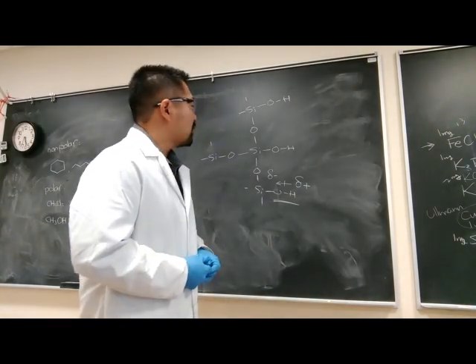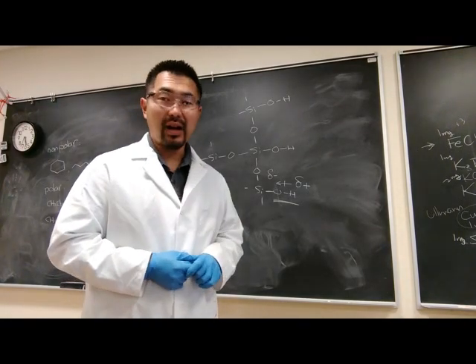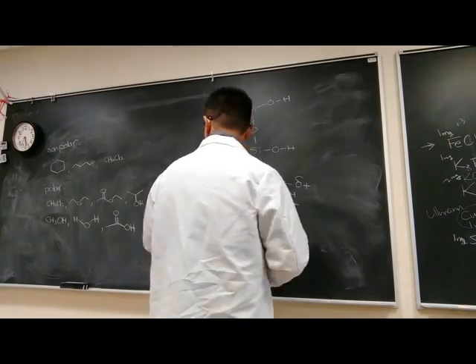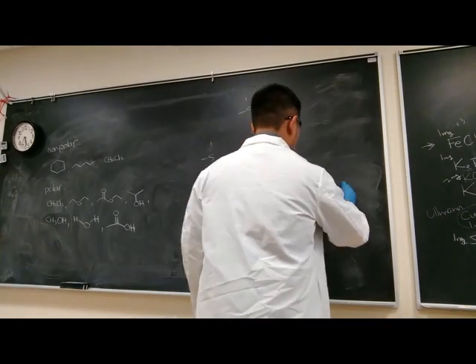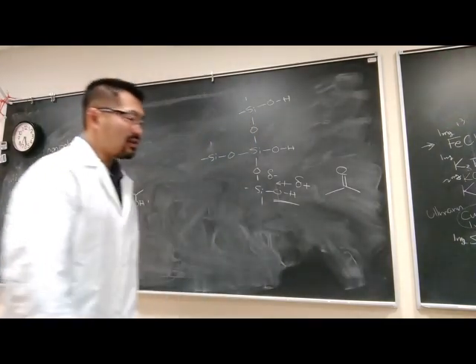Okay. So as you can imagine, any compound that has inherent polarity, so polar compounds that possess dipolar polarity, like, let's say, acetone.